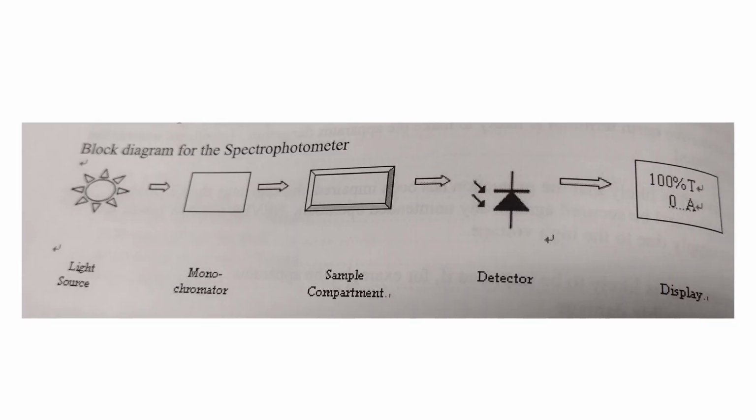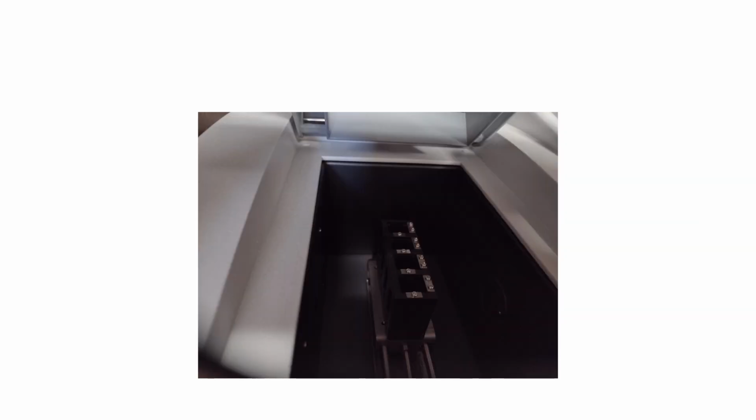And this is from the manual for the spectrophotometer, just very briefly showing you've got your light source. It's going to go through. Here is your little sample compartment. The light's going to go through, detect, and we take either that percent transmittance. 100% would be that all the light passed through. And that's going to be the same thing as zero absorbance. If all the light passed through, it's zero absorbance. Like I said, we're going to be reading the absorbance, or the A number. It prints out both numbers when you put the sample in.